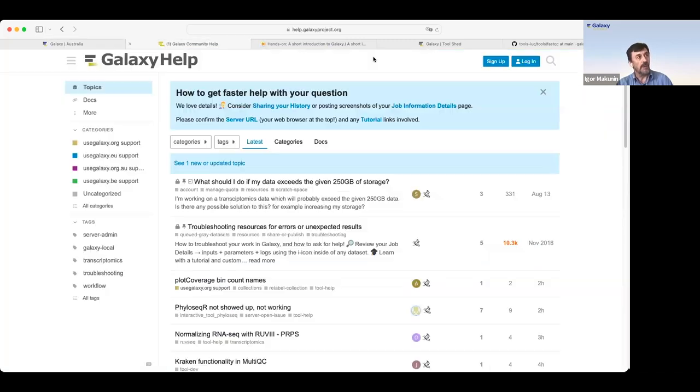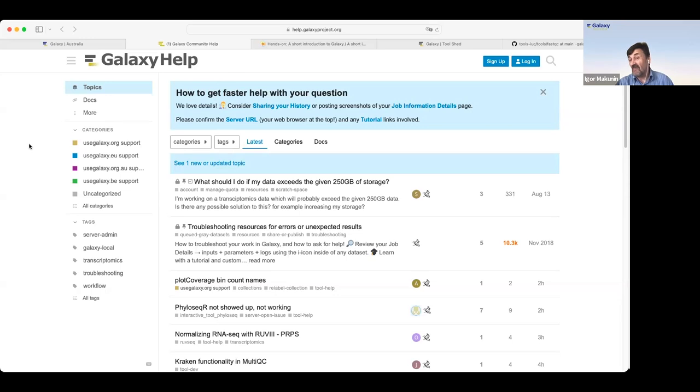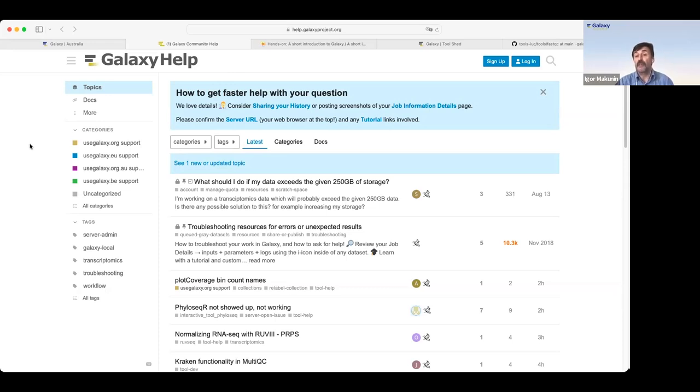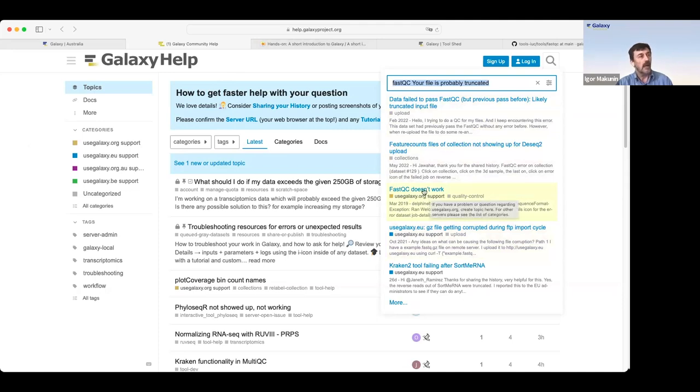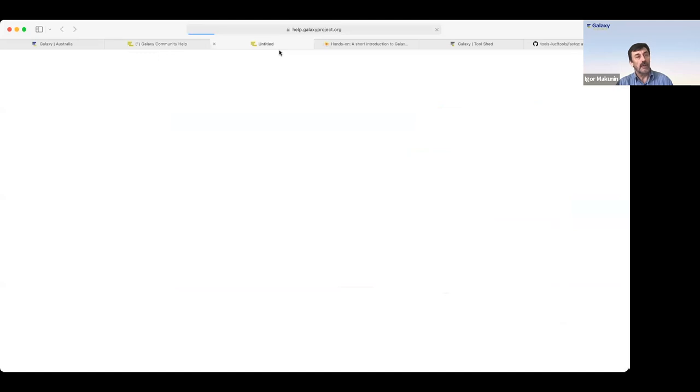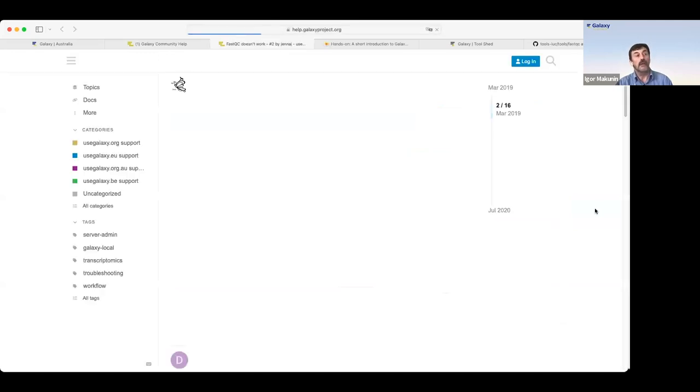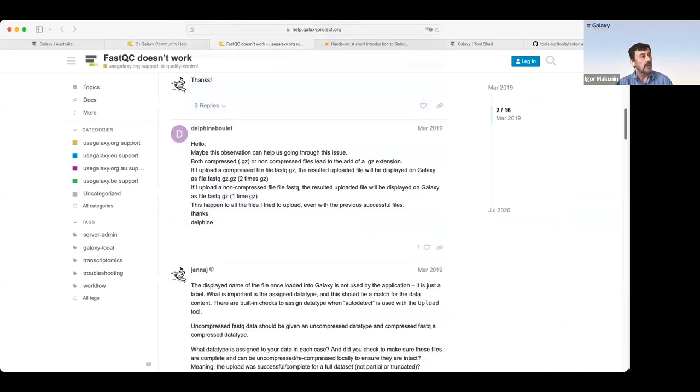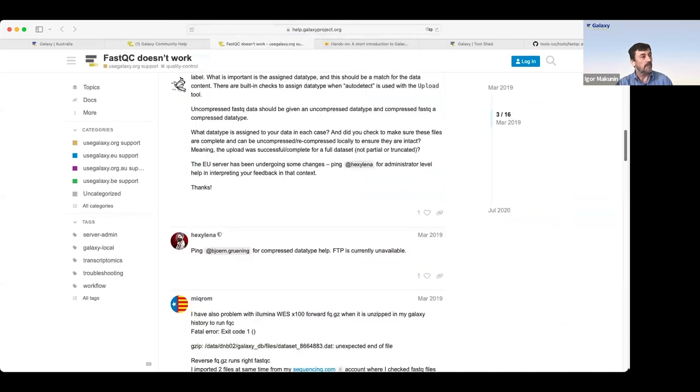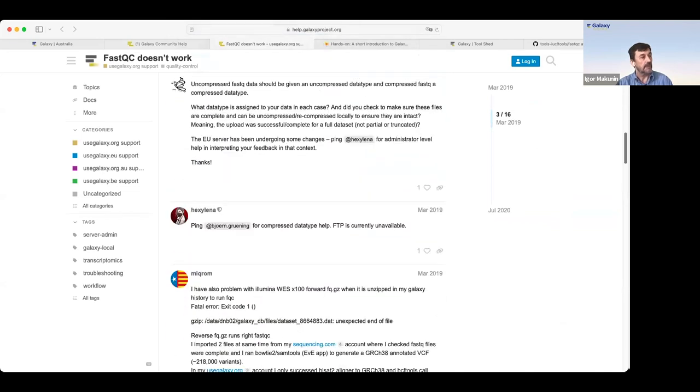This will open a link to Galaxy Community Help Forum. Galaxy platform has tens of thousands, if not hundreds of thousands active users. And we hope that someone else already experienced similar situation. So there is a search option. I already searched this message. And as you see, there are messages for FastQC. And if you click on it, you'll see not just the description of an error, but also a proposed solution for this message.